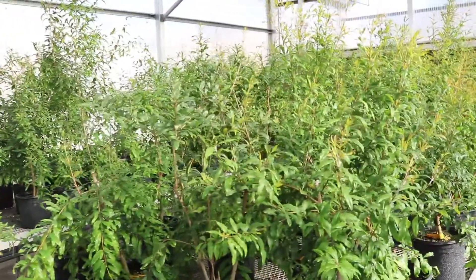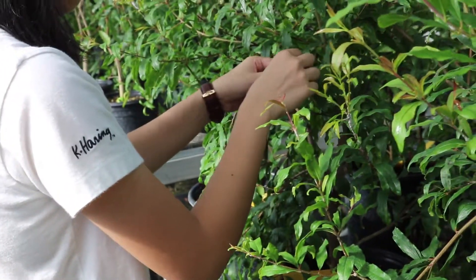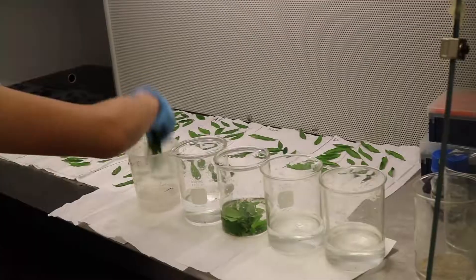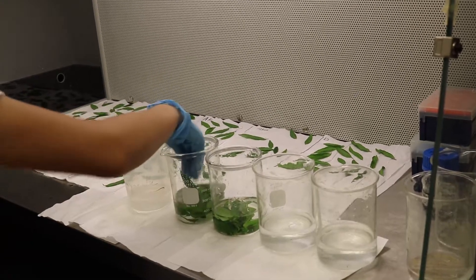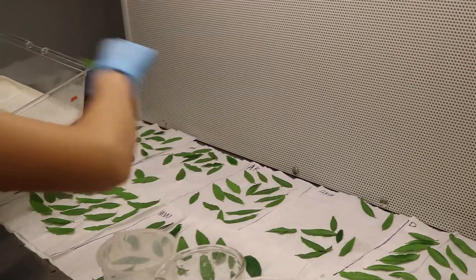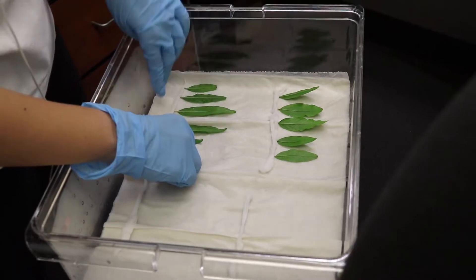To do that, we developed a detached leaf assay. First, we grow the plants in the greenhouse to keep them clean and healthy and free of disease. When they're ready, we collect the mature leaves, take them back to the lab, surface sterilize them, then prepare a clean box with wet paper towels underneath to keep it humid.